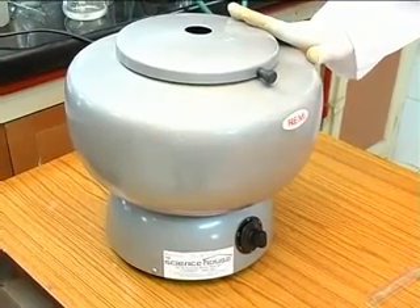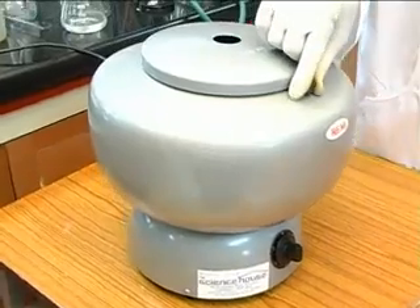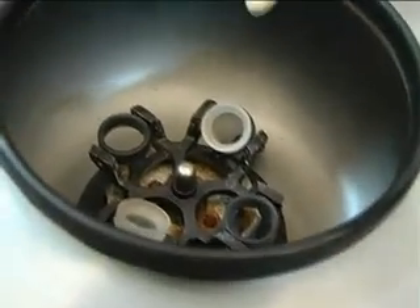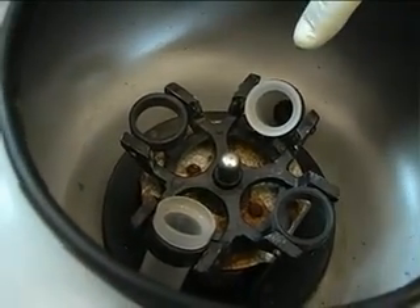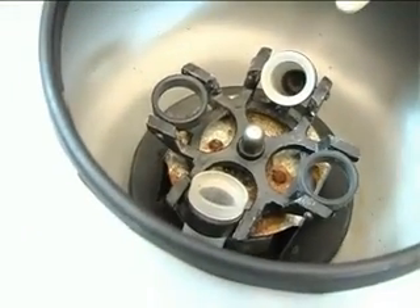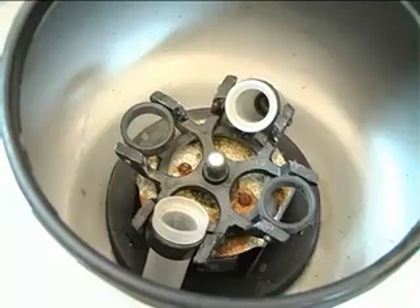The centrifuge has a motor inside to which is attached a circular disc with holders for centrifuge tubes. The holders are placed in pairs and opposite to each other. The assembly shown here rotates at high speeds when electricity is passed.